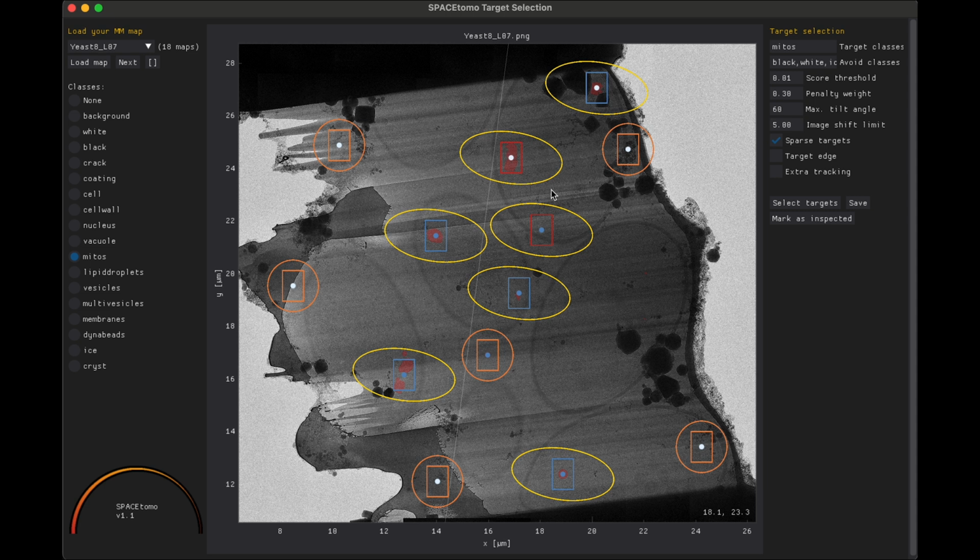So now we have one area with these 3 points here. You can see they're slightly lighter color, and if we hover over them, it says area 2. If we hover over one of the others, it says area 1, and they'll all be centered on this tracking target. I didn't notice this earlier, but it makes much more sense now to put this tracking target further down here, so these targets don't require as much of an image shift from the actual tracking area.